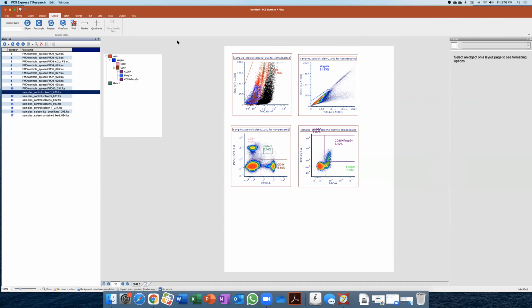So we have someone that asked: if you're doing a series of experiments using the same panel, would it be appropriate to move the gating and analysis to ensure populations are included? And if so, how would you try to avoid including unconscious bias or subjectivity? I could throw in my 2 cents on it and see if everyone's all right.